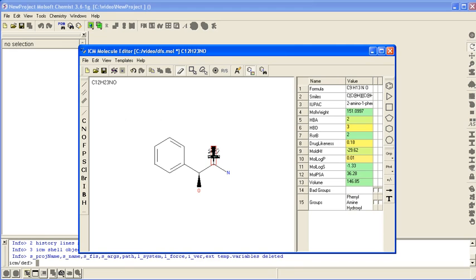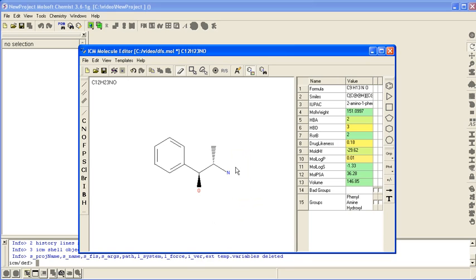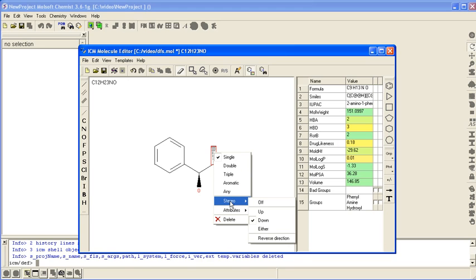You can set chirality to stereo, so up and down. By right clicking on the bond, select stereo up and down.